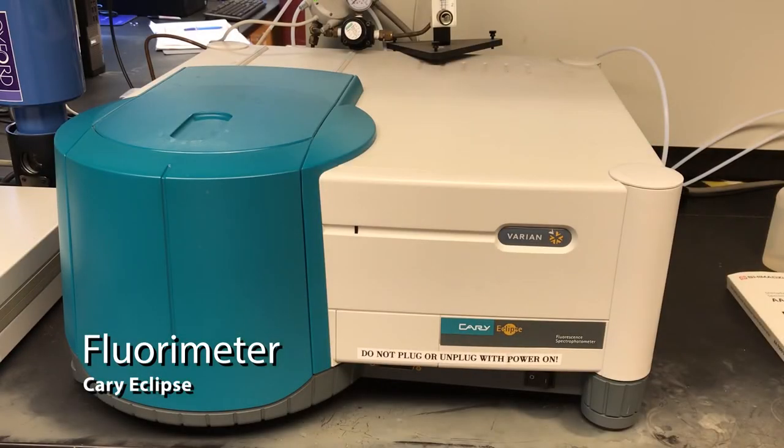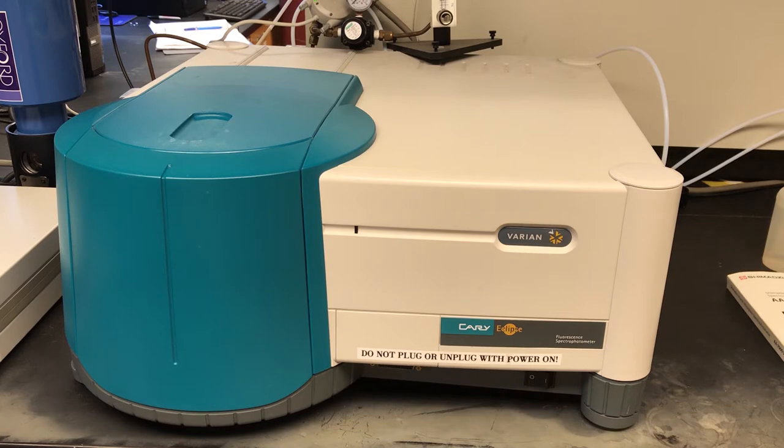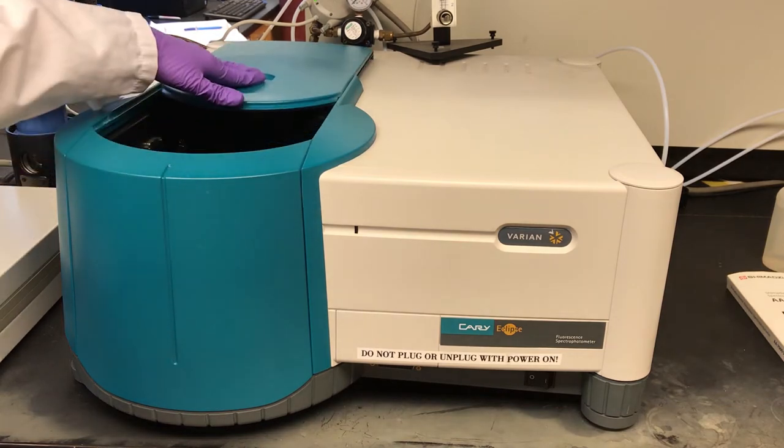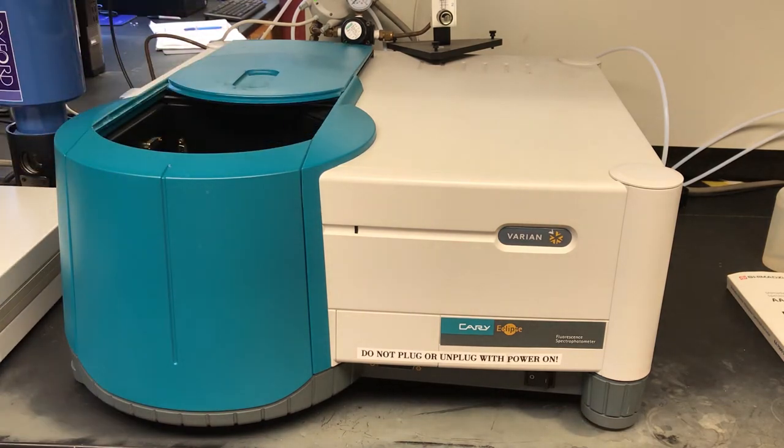So this is the Cary Eclipse Fluorescent Spectrometer. Sample compartment is here.